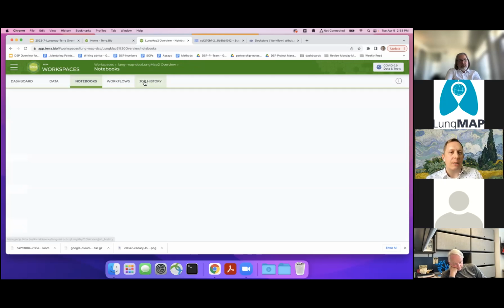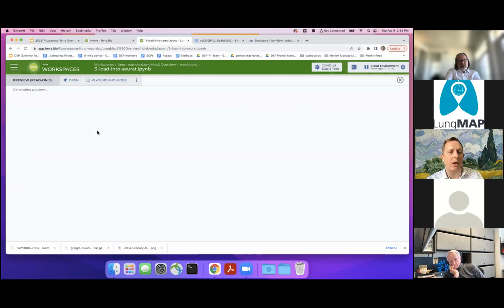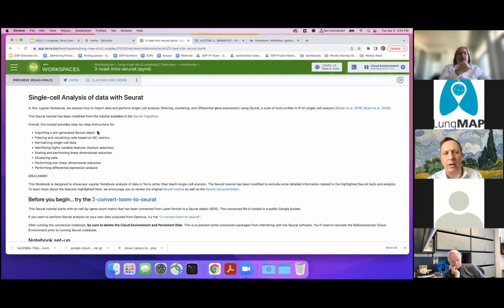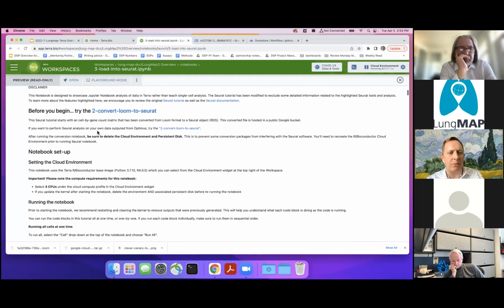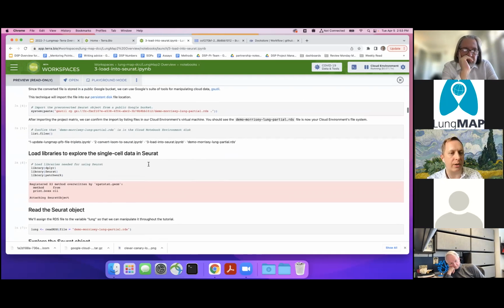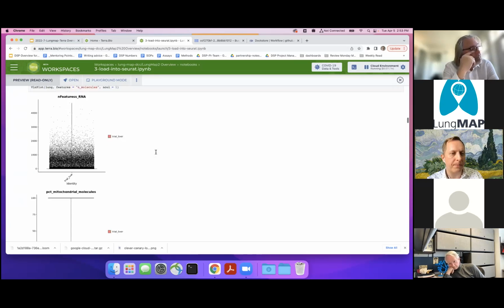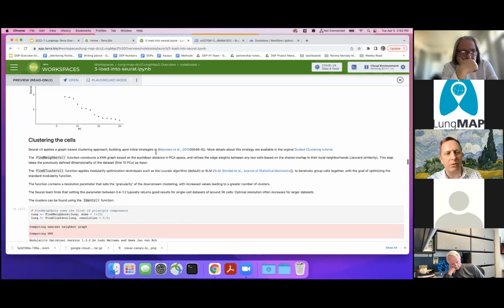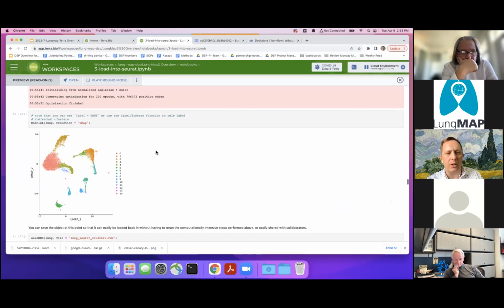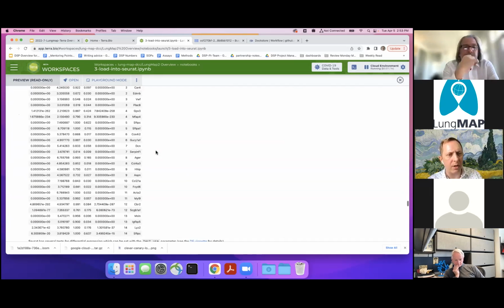So more interesting, another example, not super interesting. Honestly, if you want to look at the analysis, you should go to the paper. But another example is after you do have that file that Seurat could use, working with it in the notebook, if you feel like that makes sense for you. And so this is an example just showing you that that's possible. Once again, this is in R, installing a couple things to get started, reading in the RDS file that I made in the previous notebook. And then this is going through the standard Seurat tutorial. So a lot of this stuff, if you've seen Seurat, should make sense to you: seeing the UMAPs, selecting variable genes, being able to do a little bit of differential expression off the clusters, just like the standard stuff they have there.